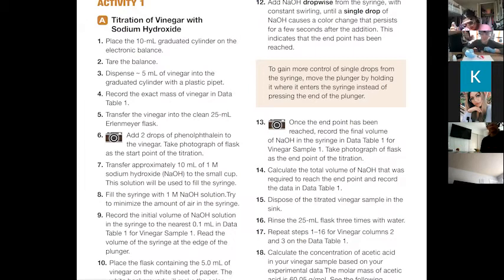So let's just do it again. That was our first one, 4.5 mils, and we know that one's probably a little bit much. So I'm just going to dump this, and we'll do it over. Give it a rinse. Pretty cool, right? Although it went over really fast. Well, that's just it. When you get close to the titration point, the pH changes really fast. It changes a little bit and a little bit, and then all of a sudden, boom, it changes very quickly.